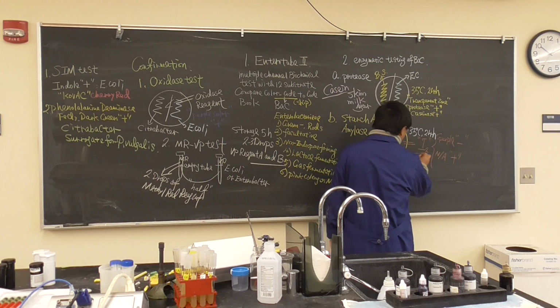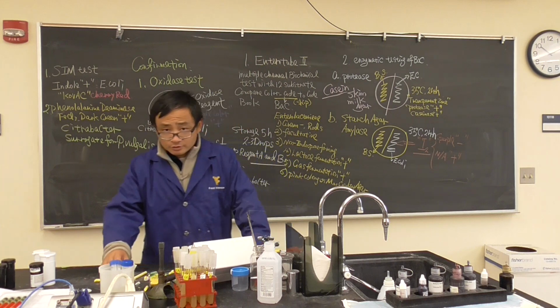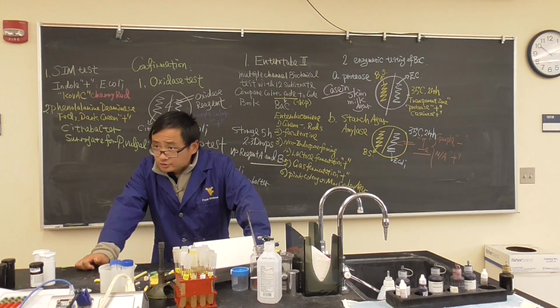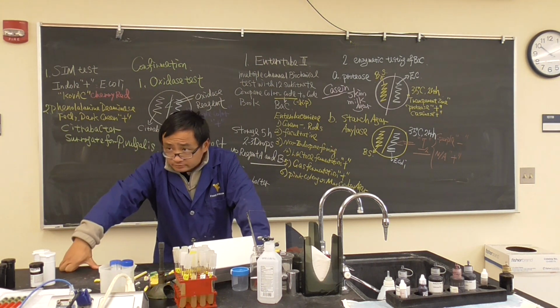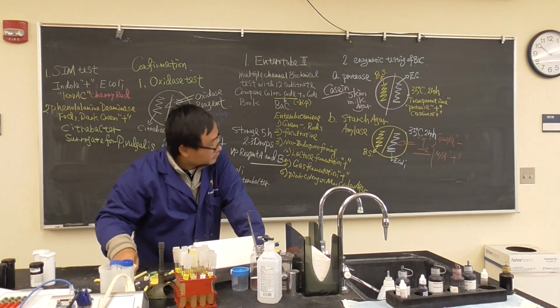Dump iodine on Thursday. Okay, is that clear? Because when we grow the bacteria there is no way we know whether they use the starch or not. So how do we do it? Dumping gram iodine, it's the same thing. If you see a purple to brownish color, then we say the starch is still there because it's reacted with iodine. So there's no amylase. If the amylase has hydrolyzed the starch, then it's going to be colorless because it's changed. Okay?